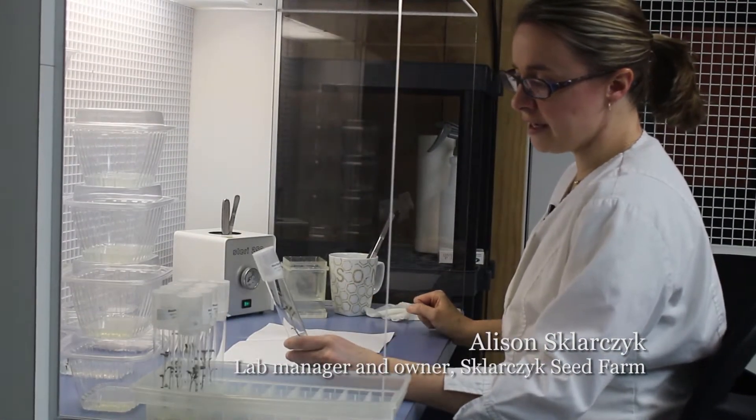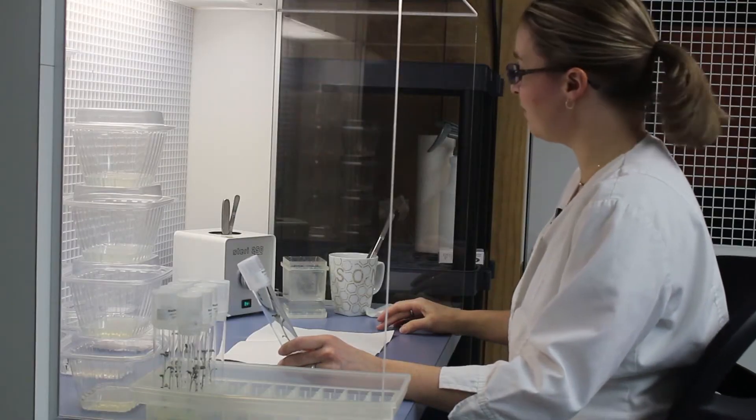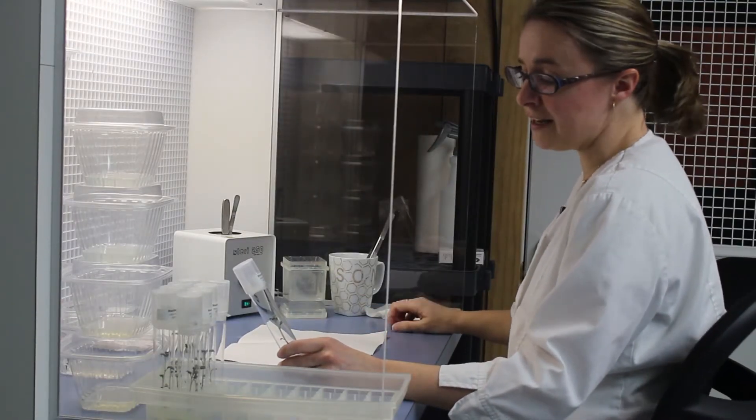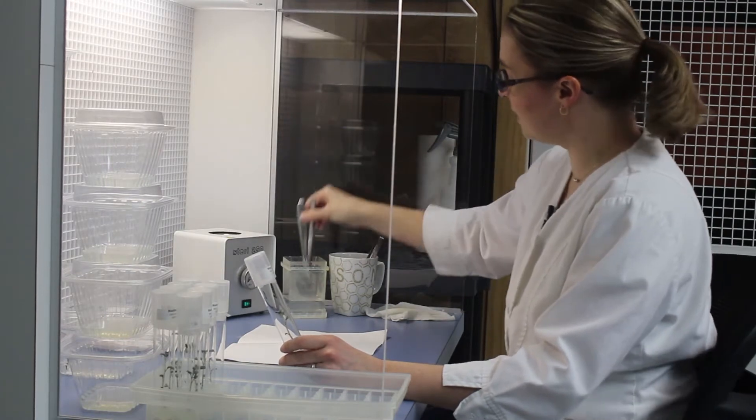We've got our new variety in yesterday from Michigan State called Blackberry. It's a purple flesh, purple skin potato. We're very excited to have a new variety, colorful, a little bit different from what we normally have in the lab.